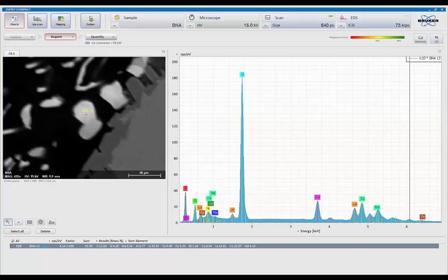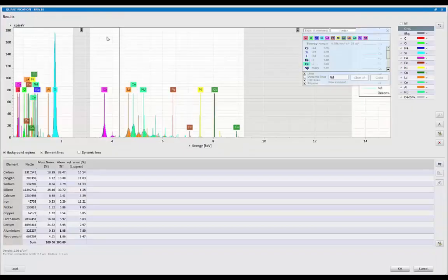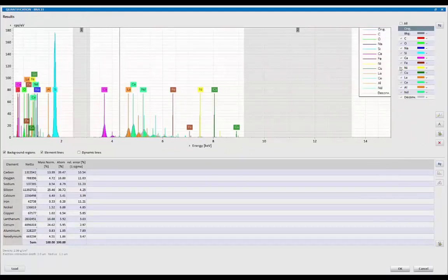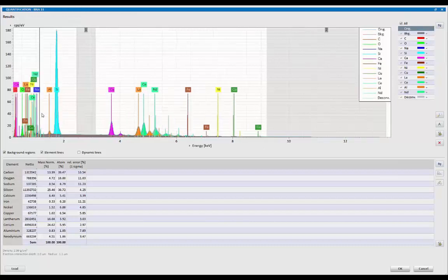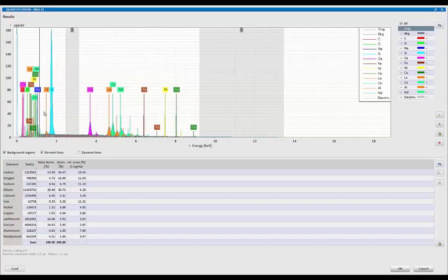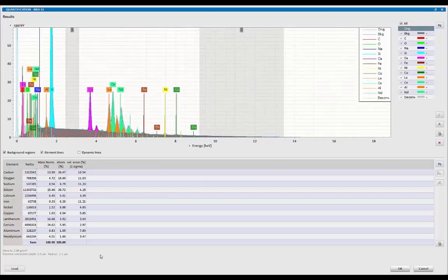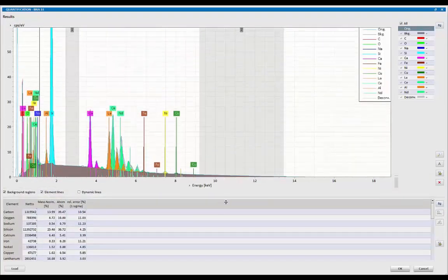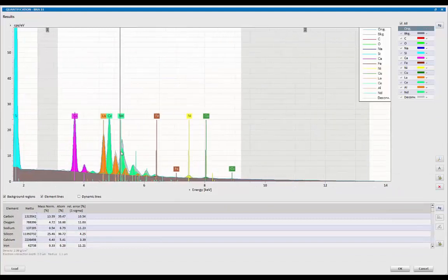If I change this rotor to parallel lines simply by clicking on it, I go into an interactive mode. So now when I hit quantify, this panel appears. And now it's showing me the results of the exact analysis. So I can come in here and see the background fitting region windows plus the background it used itself and the results. But I can also go into an interactive mode.